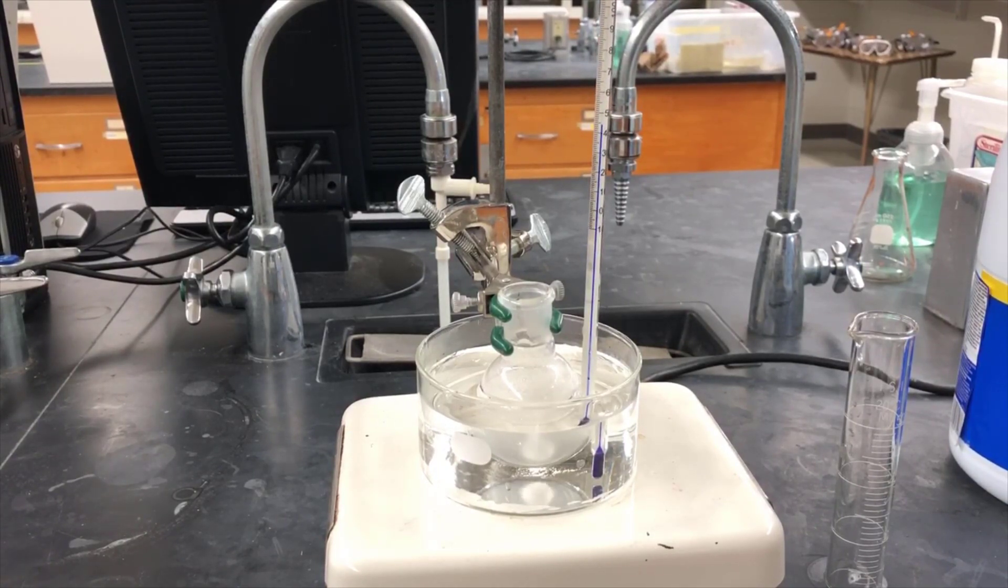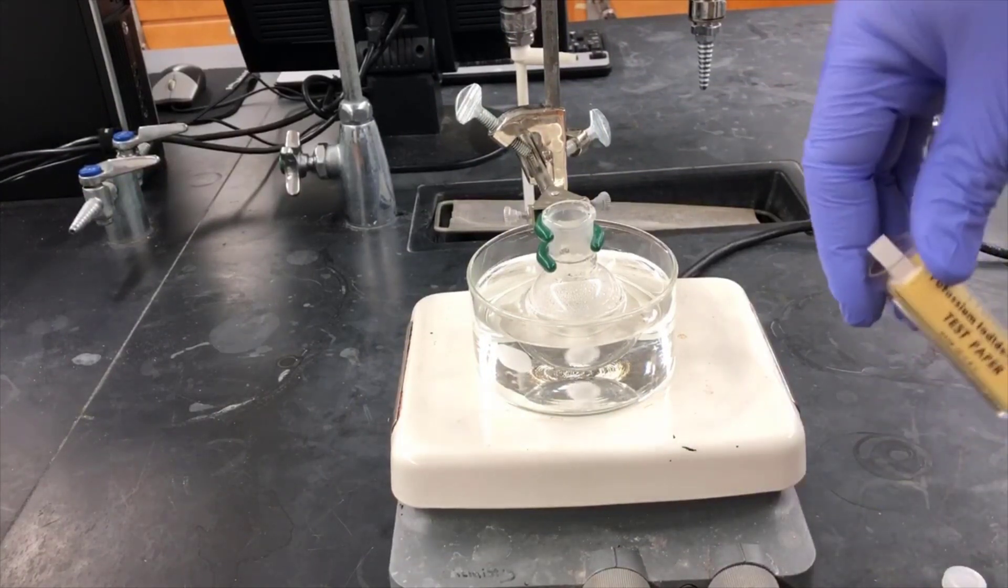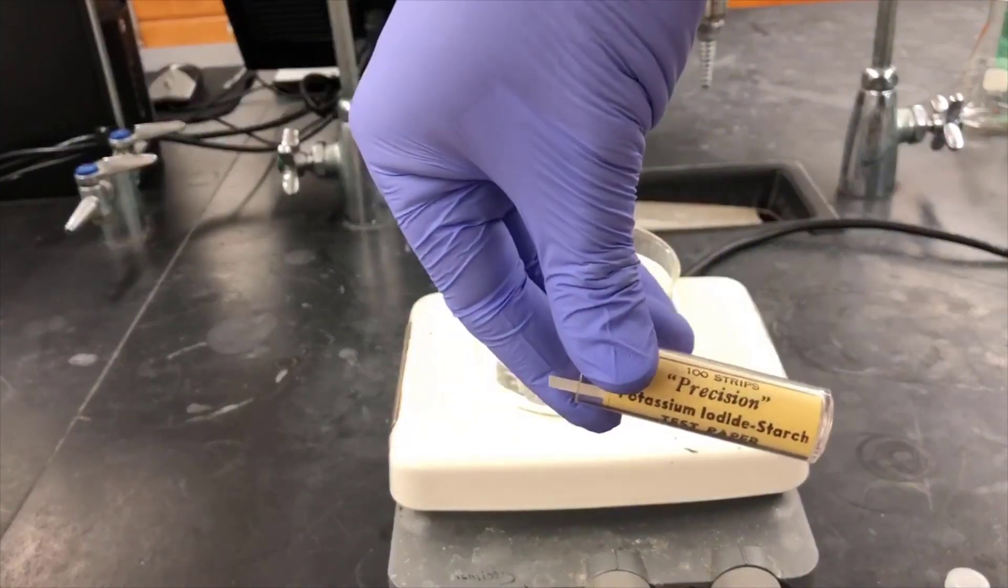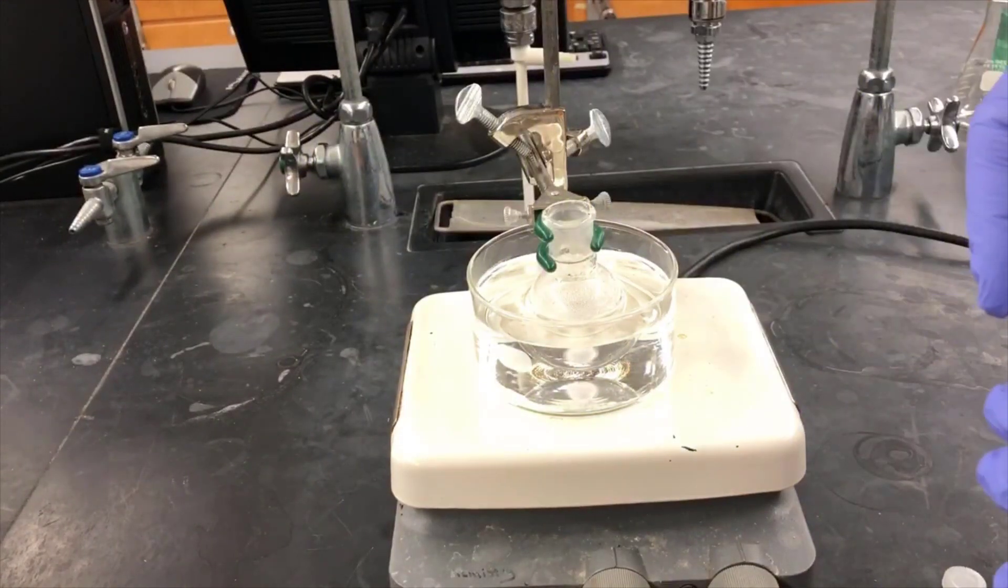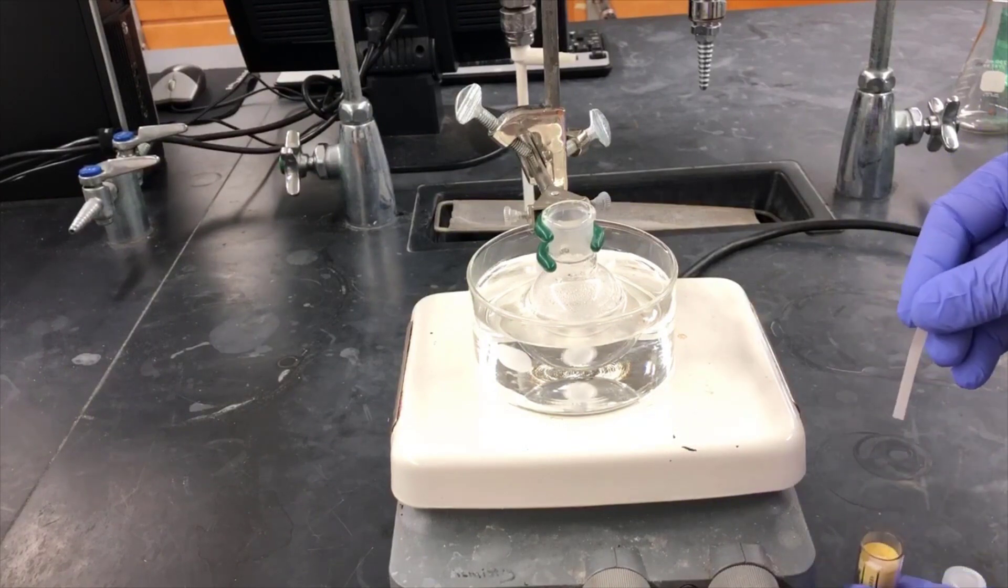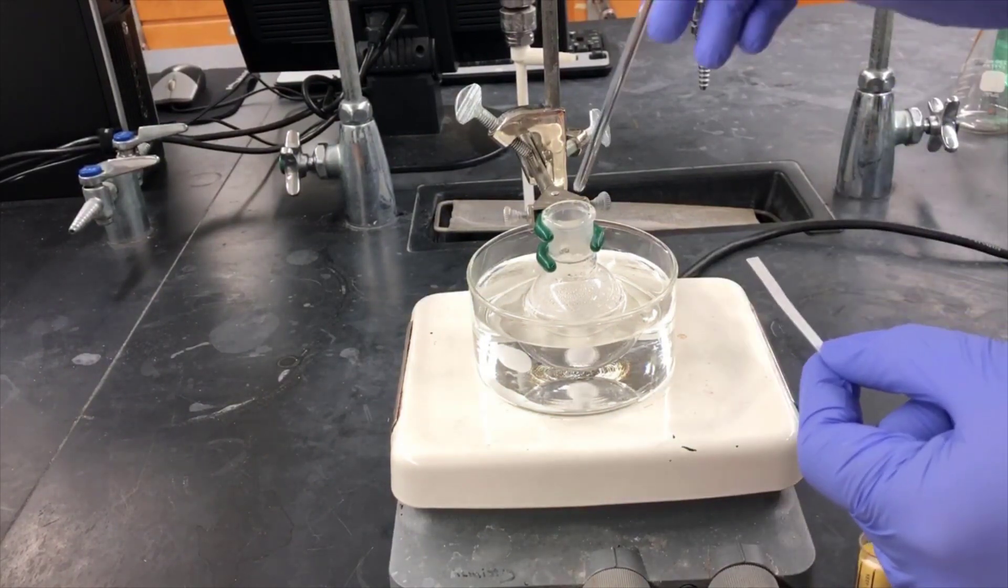After 20 minutes, the oxidation of cyclohexanol to cyclohexanone should be complete. Now we need to test to see if there's any leftover hypochlorous acid. These are potassium iodide starch paper test strips. When they touch hypochlorous acid, they turn a black color. I'm going to dip a glass stir bar into the solution and touch it to the test strip to test the solution.